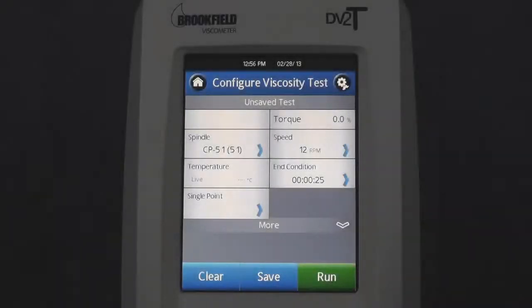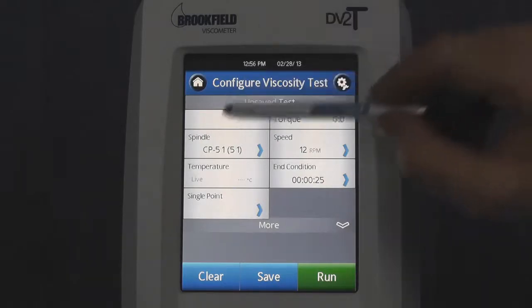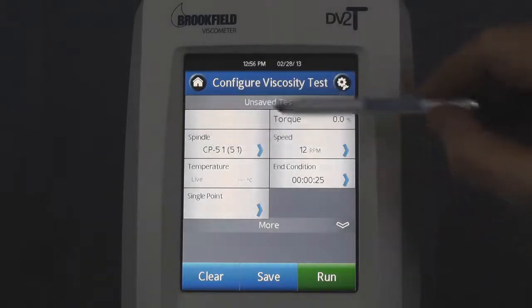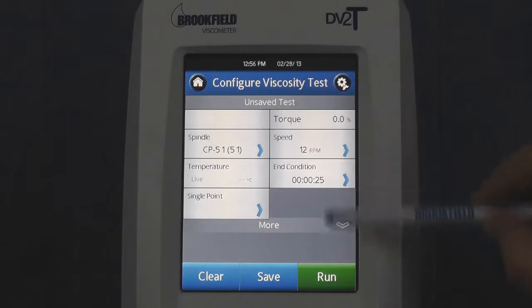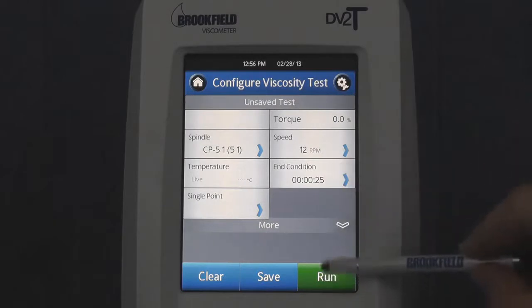Once you've completed the AutoZero and screen calibration processes, it will bring you to the Configure Viscosity Test screen. To run a test, simply choose a spindle, a speed, and press Run.